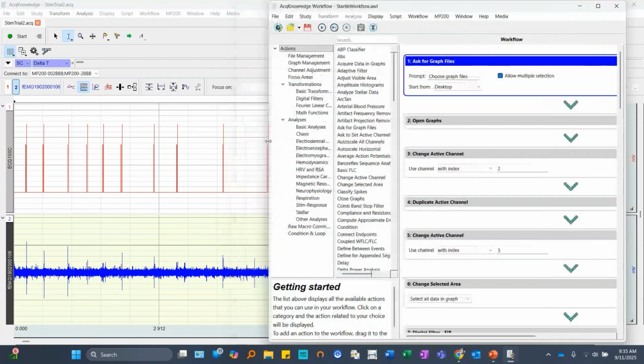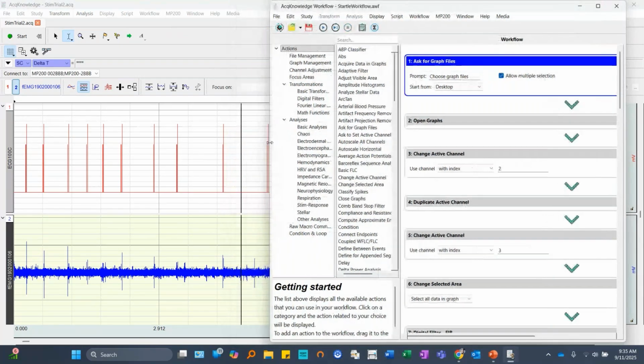As I mentioned previously, a couple of the key measures that people look at are the amplitude of the EMG, the peak amplitude of the EMG response, and of course the timing, the latency, which is the timing from when the startle pulse occurred to when, again, the maximum EMG response occurred.